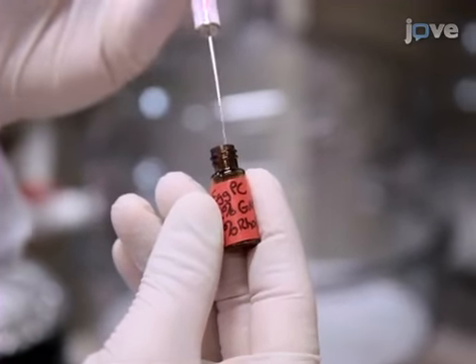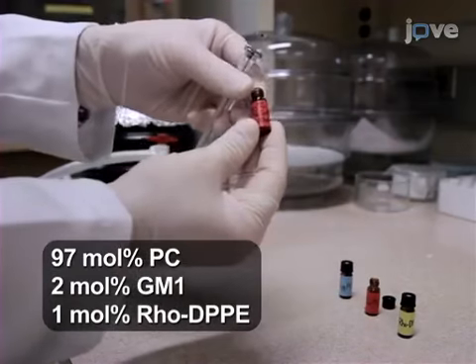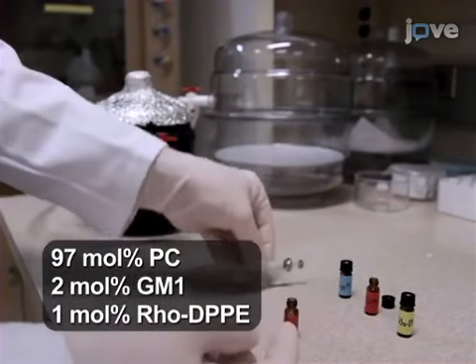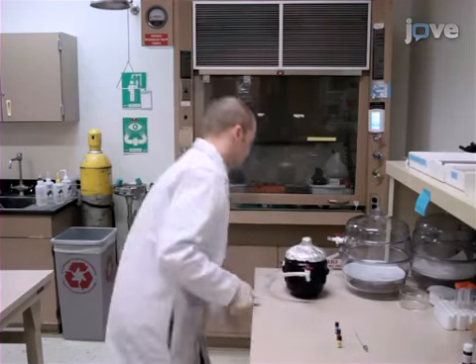First, in a small glass vial, mix the component lipids for the vesicles. A total of 0.5 milligram of lipid is in this solution. Under vacuum, desiccate the mixture for 6 hours.